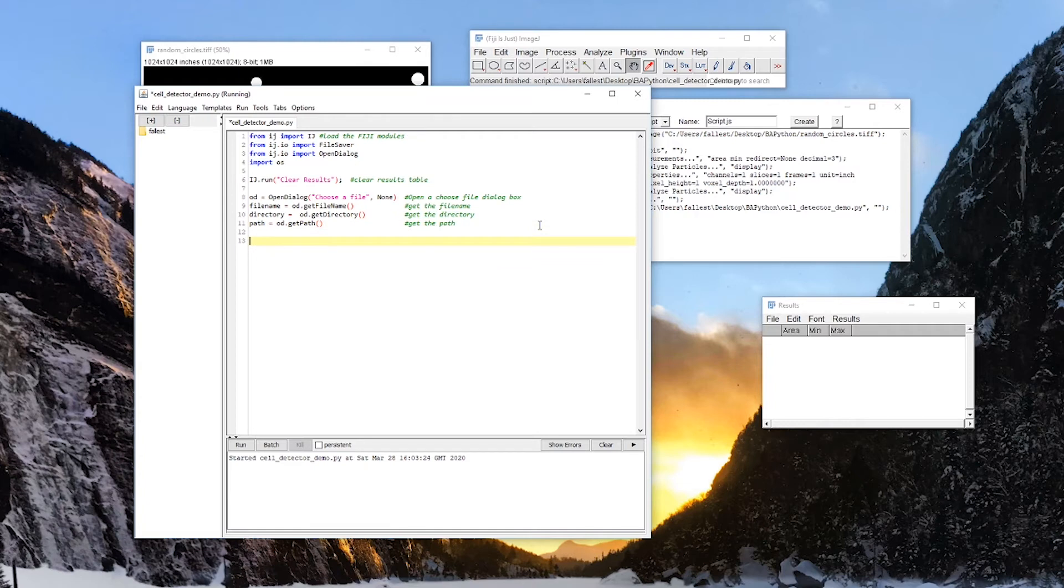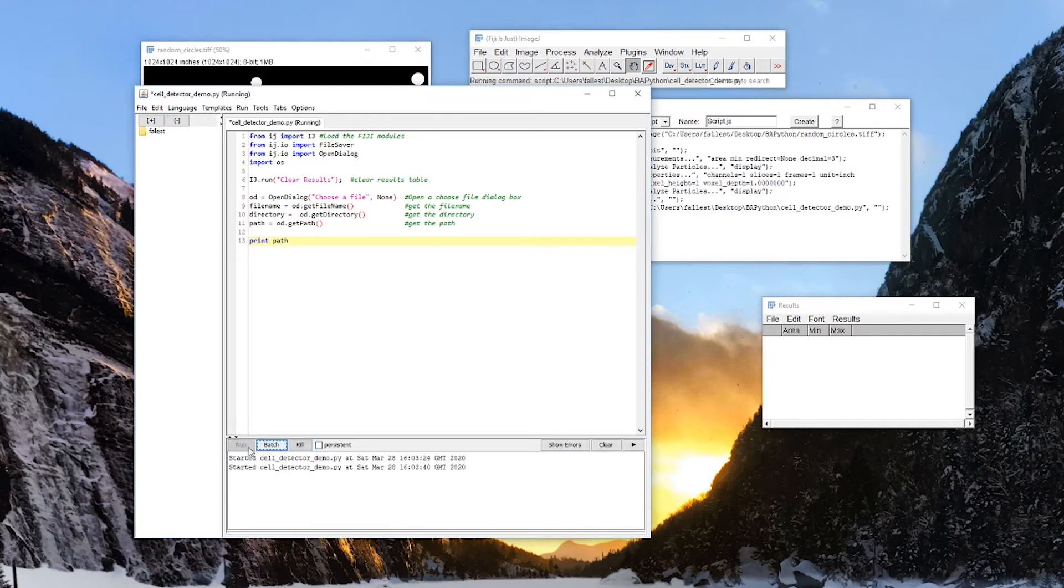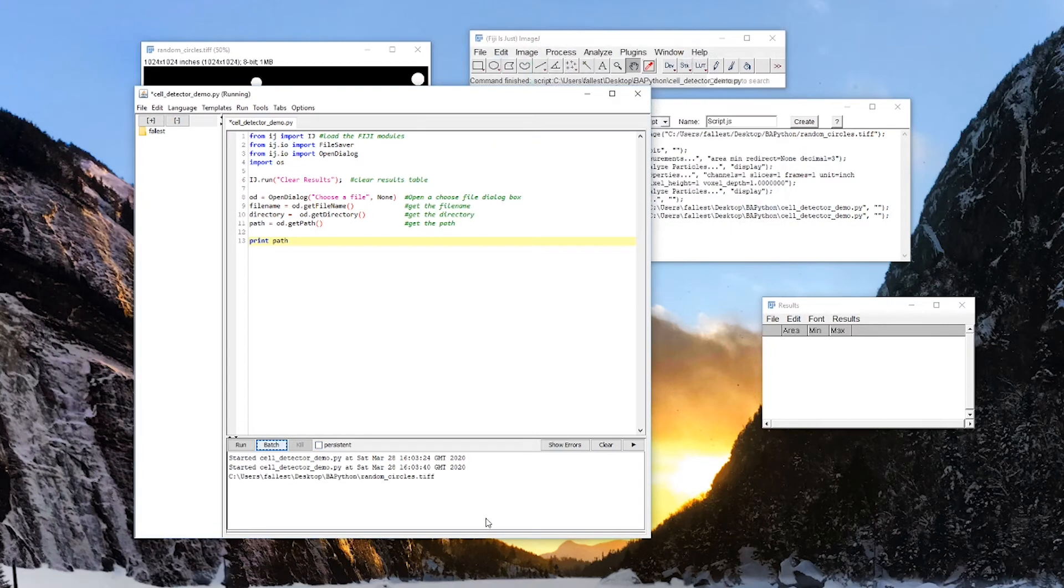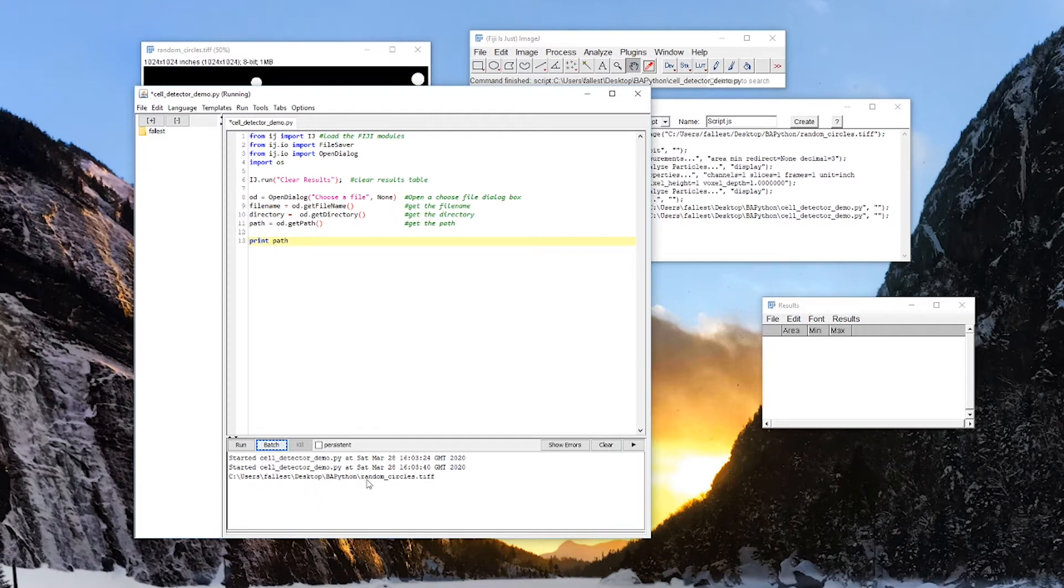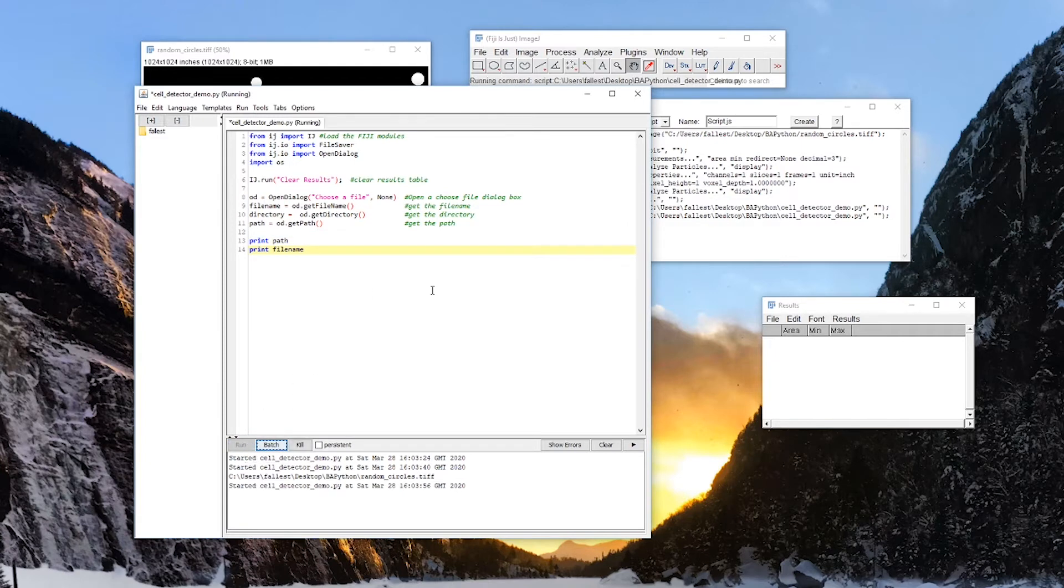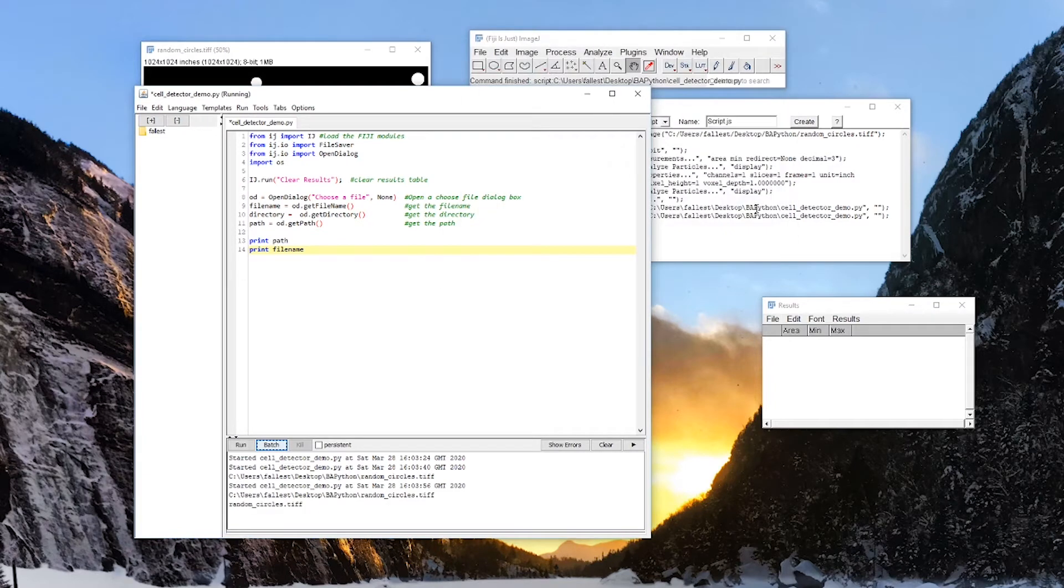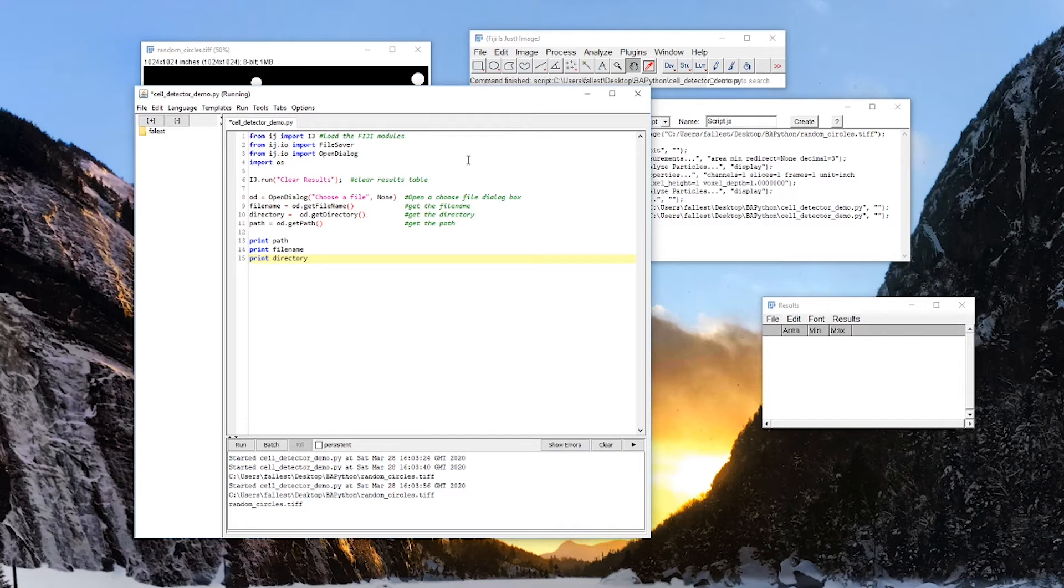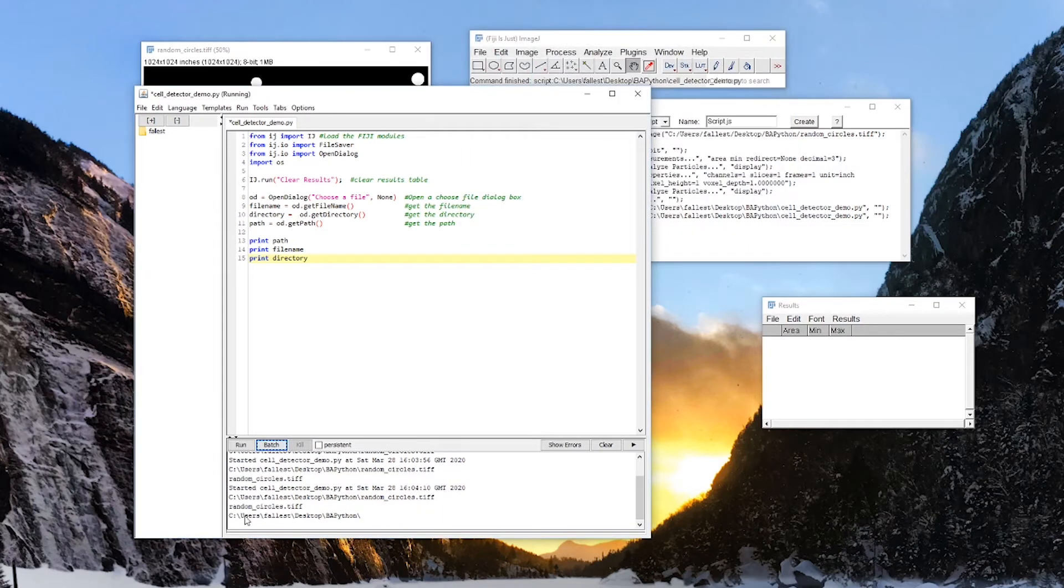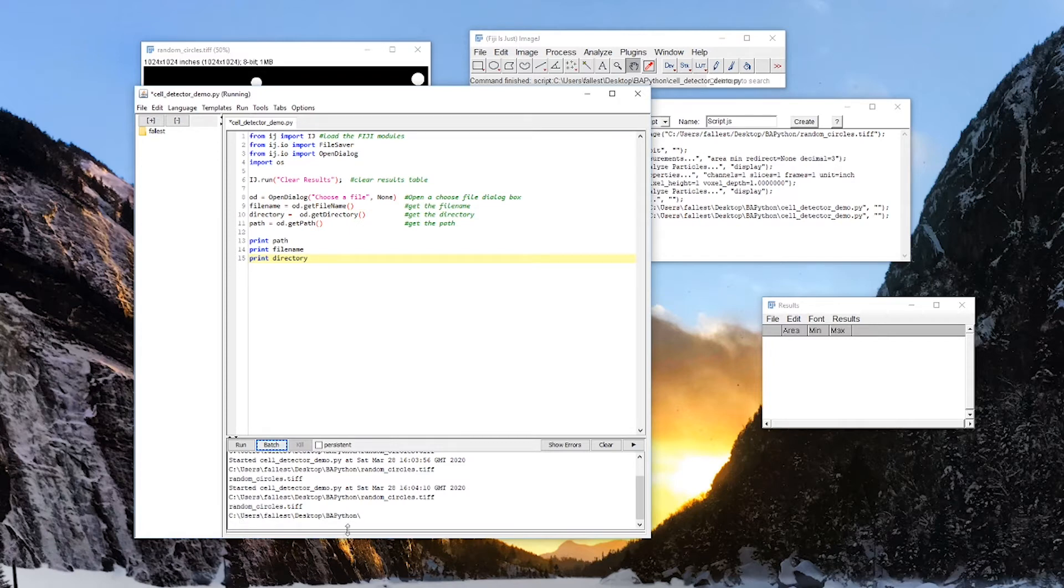So I can check, rerun that, and it should give me, here's the path. C, users. This is my login name, desktop.python, randomcircles.tiff. What happens if I just print the file name? We just get randomcircles.tiff. And if I print the directory, we get the directory that it was written in. Now this could be useful because later on we might want to use this directory to save our data in.